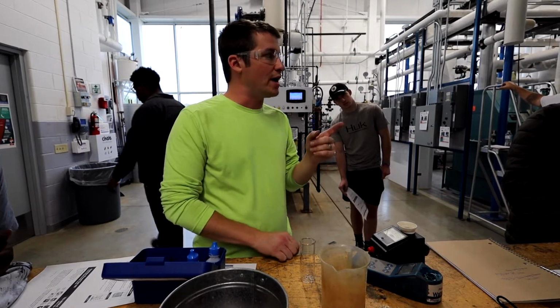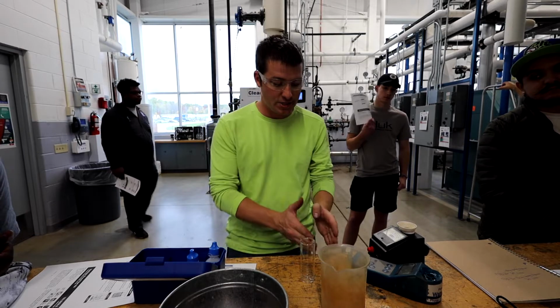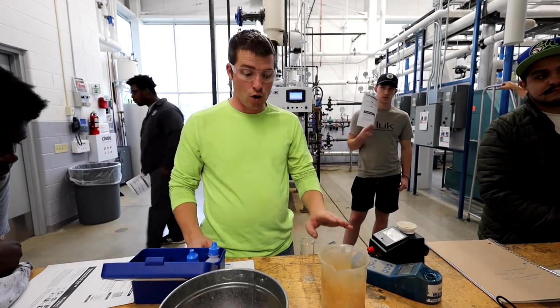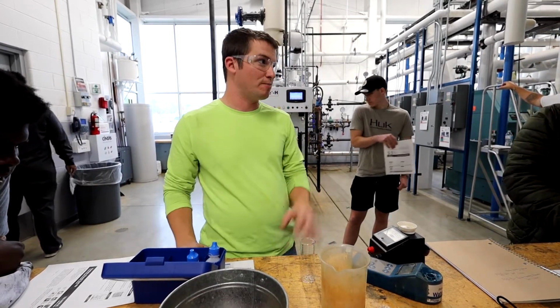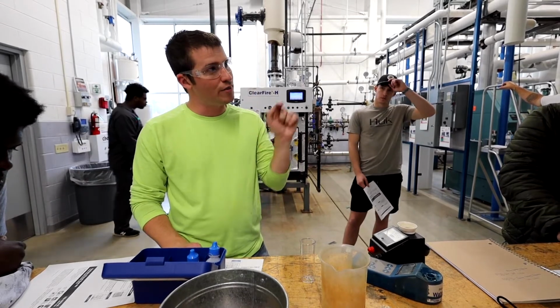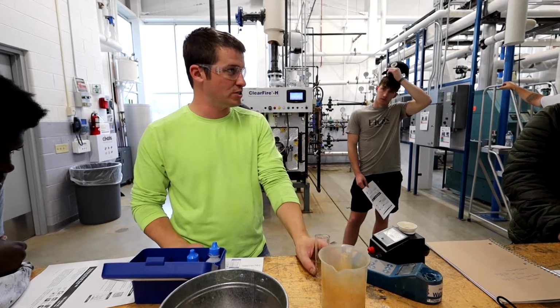No matter what, at some point it turns blue. So when you get to the end, when you get to how much hardness you actually have in the water, it'll turn blue. Whether it's 0, 1, or 1,000, if I just add enough drops, at some point it's gonna go blue. It's understanding when it finally goes blue, that reading, is that okay or not okay? So if it would have turned blue right away, it would have been 0, that's great.